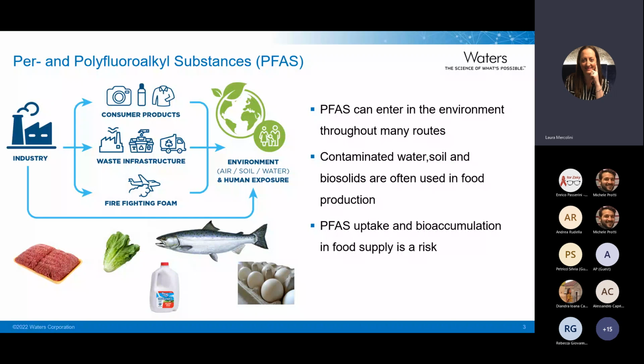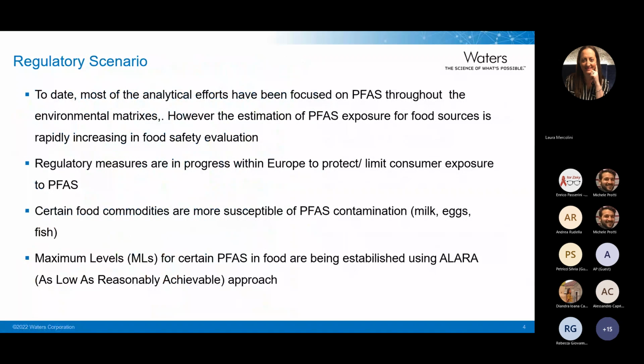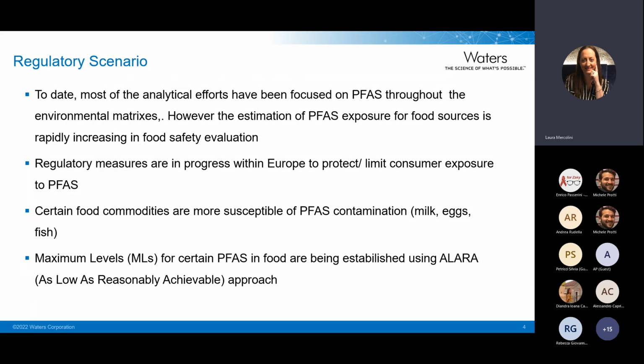PFAS uptake and bioaccumulation in the food supply could be a risk. To date, most of the analytical effort has been focused on PFAS in environmental matrices. As I mentioned before, we have already developed several methods for the identification and quantification of PFAS in water, wastewater, and other environmental matrices.